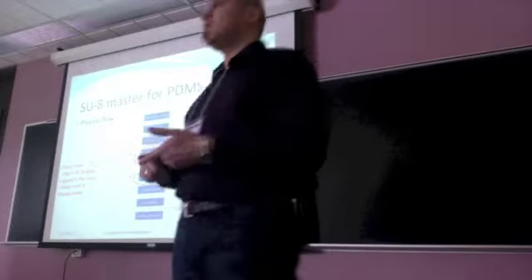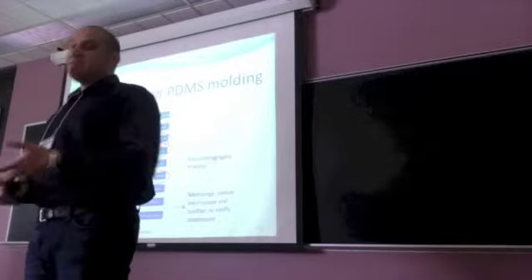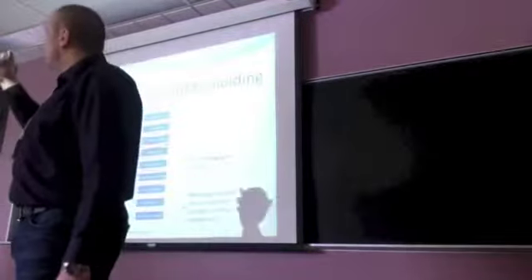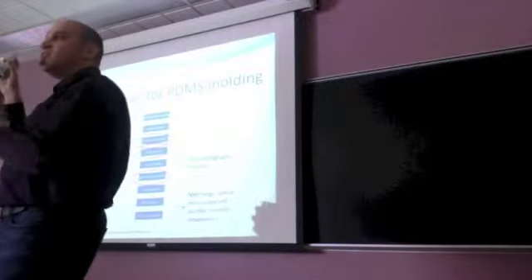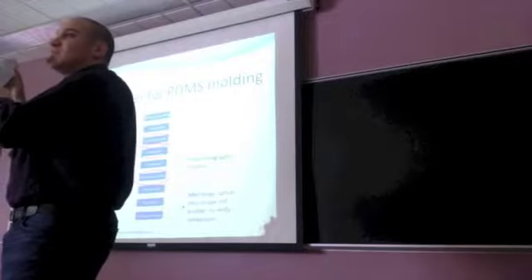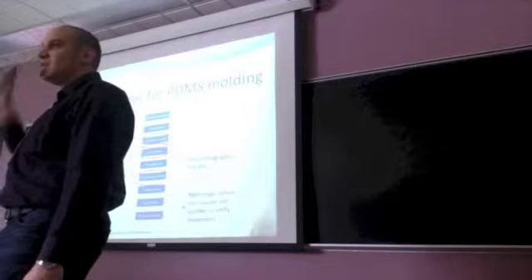If you don't use the right temperature and the right time, you can have a delamination problem of the resist. This is the case for this wafer. After the first PDMS replica, the SU8 layer came out, and there was a delamination, you will see on this wafer.